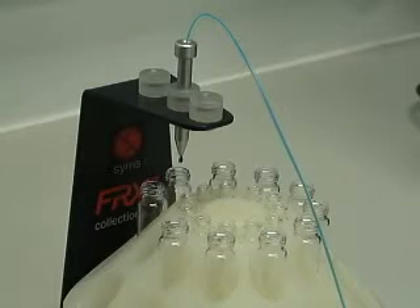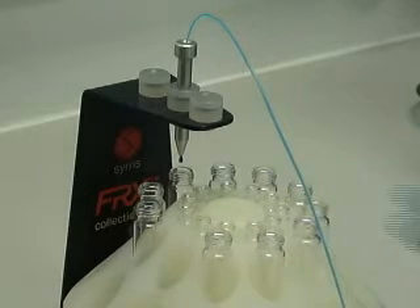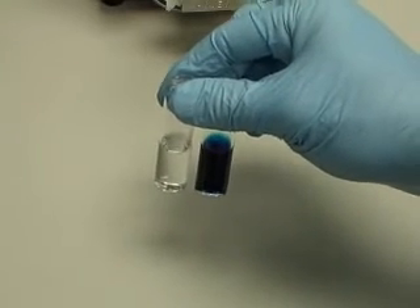We're using the FRX collection module here to collect the aqueous component. This is a simple twist and click fraction collector, enabling different slices of the flow stream to be collected separately. The final products are collected, having been successfully separated.